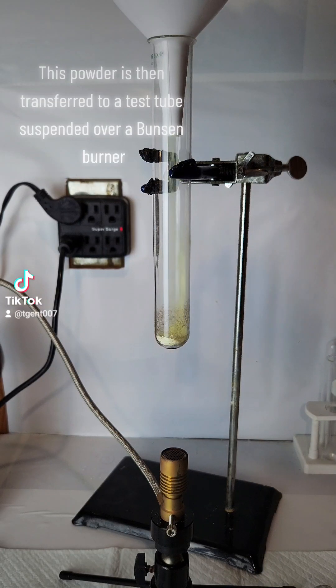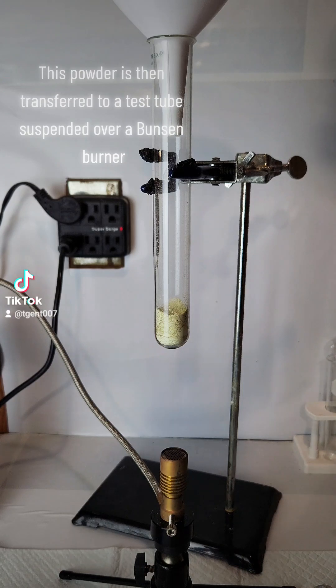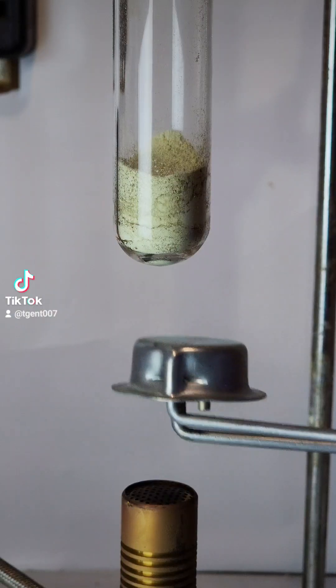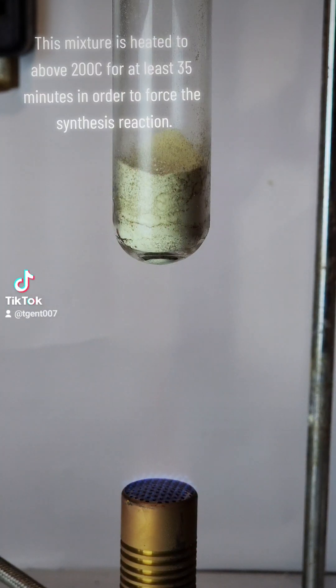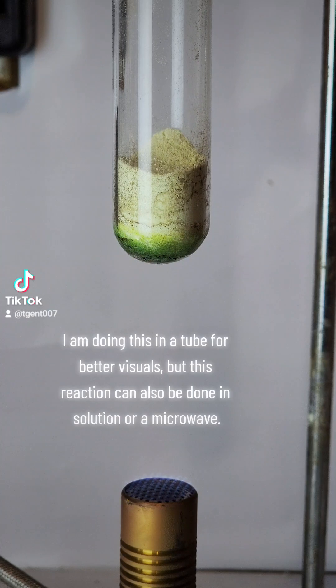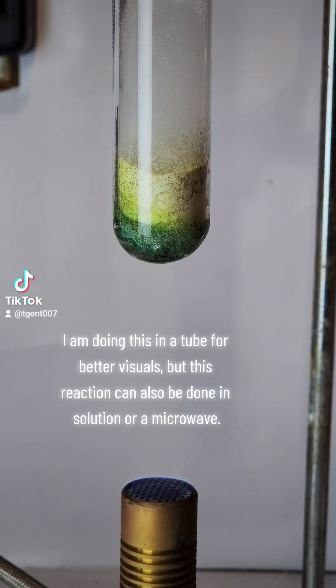This powder is then transferred to a test tube suspended over a Bunsen burner. This mixture is heated to above 200°C for at least 35 minutes in order to force the synthesis reaction. I am doing this in a tube for better visuals, but this reaction can also be done in solution or a microwave.